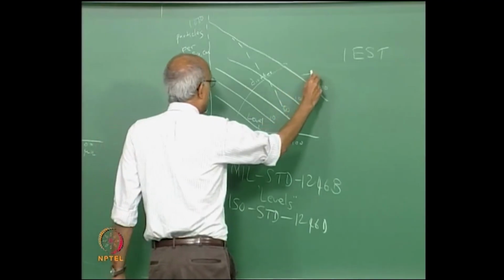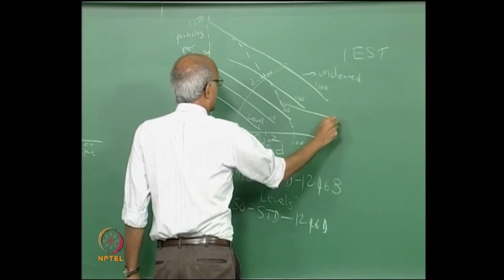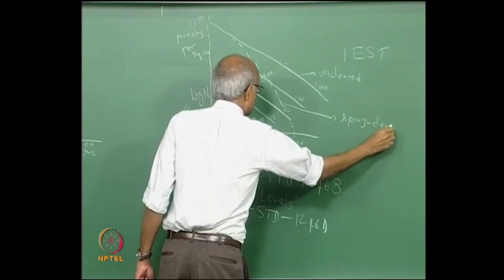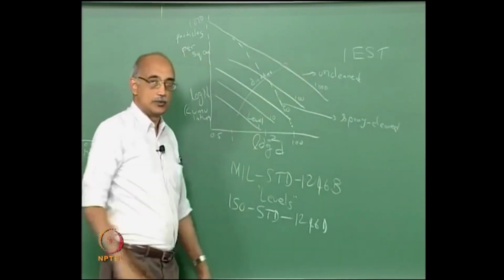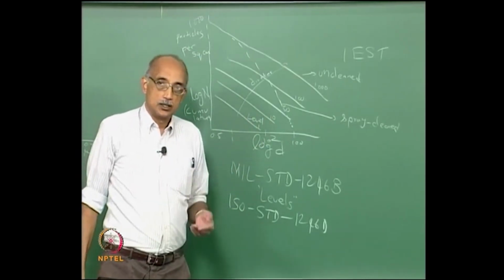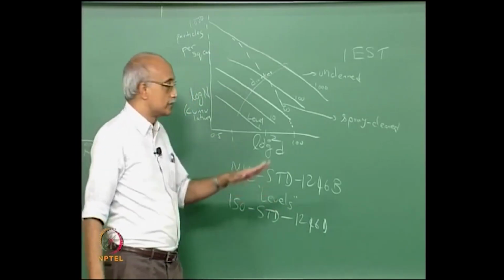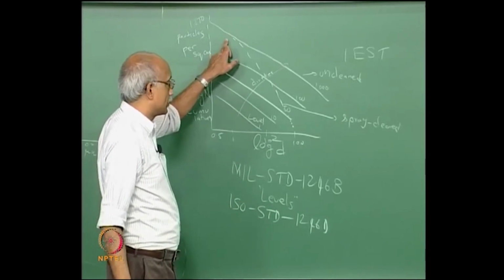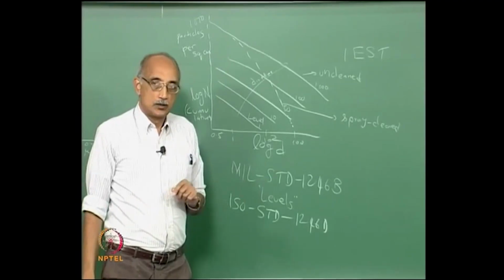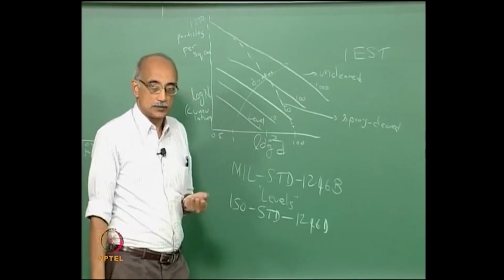So, if this is an uncleaned level 1000 surface, then this is for a spray cleaned surface, which was a level 1000 to begin with. So, essentially when you use a technique that is based on shear forces, it can remove large particles very effectively, but it leaves these finer particles undisturbed. So, the counts at half micron level may remain unchanged even after you clean it with the water or whatever, but there will be a drastic reduction in the particle count in the larger sizes.